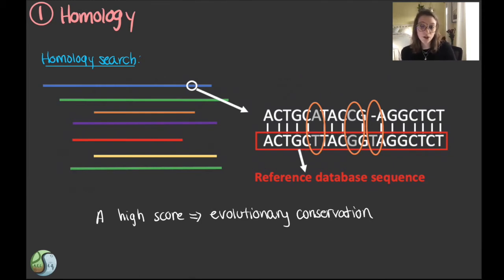In theory, you could search your metagenome against any database. However, because of the huge amount of sequences to sift through, running programs to carry out these types of searches can take several hours or days. Usually, they are run on supercomputing clusters. In order to run your sample on Galaxy, we are just assessing the presence of 5 resistance gene families, and the samples provided are each small portions of the total metagenome of the soil and water samples.